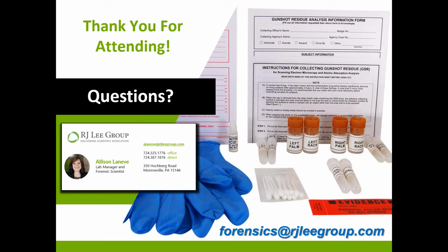That's a great question. We get lots of questions about the chicken or the egg. Do we want to collect GSR first or DNA first? To be honest with you, a trace evidence analyst is going to tell you collect for GSR first, and a DNA analyst is going to say collect for DNA first.